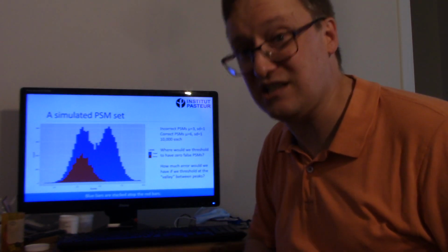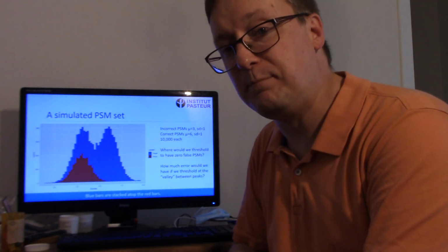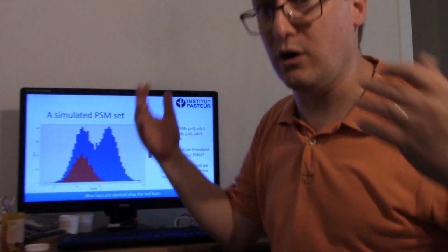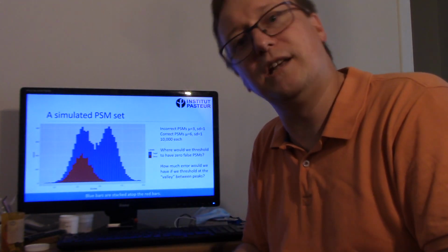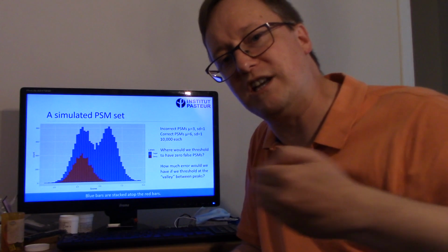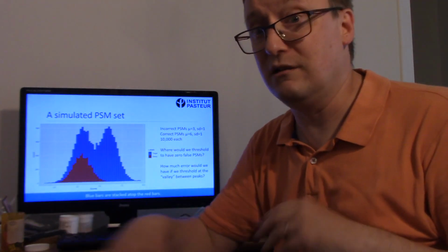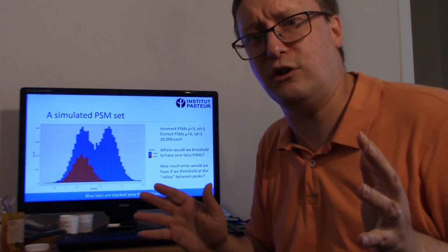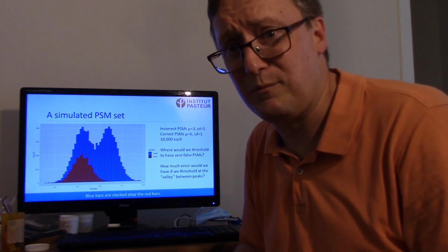That is a big hit to your sensitivity. Because I got to tell you, every biologist you work with is going to want to have more peptide spectrum matches, more proteins identified. And if you place your criterion so high as to exclude all decoy hits, yes, you can have great confidence in your hits, but there's a lot you've left on the table that you would have liked to accept as well.